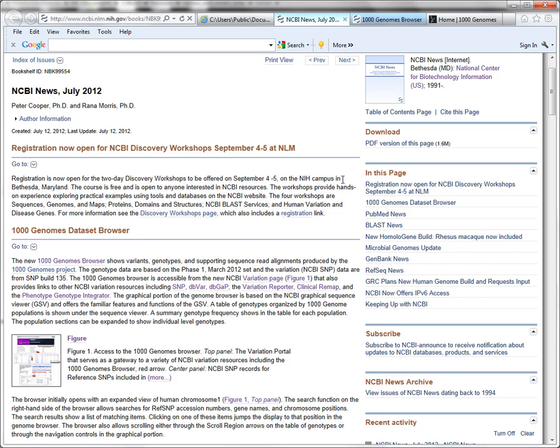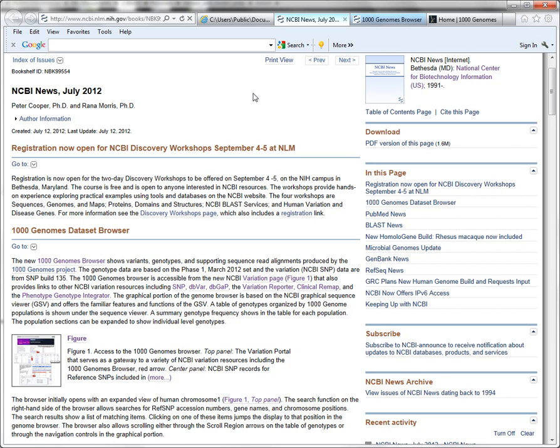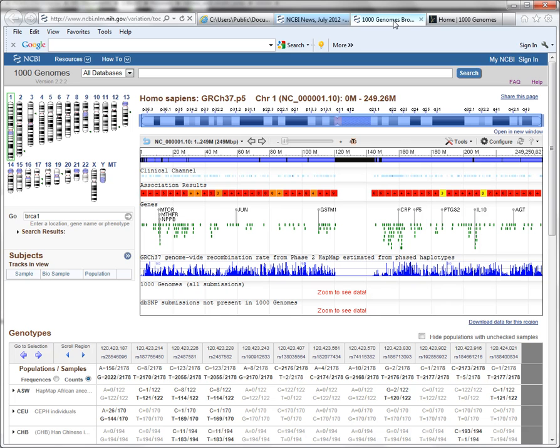You can read a description of the tool here. What I'm going to do is just click over to the browser to show you it. So, here is a browser page. This is what you're going to see as soon as you access this browser, because by default it will have a chromosomal location loaded into it.